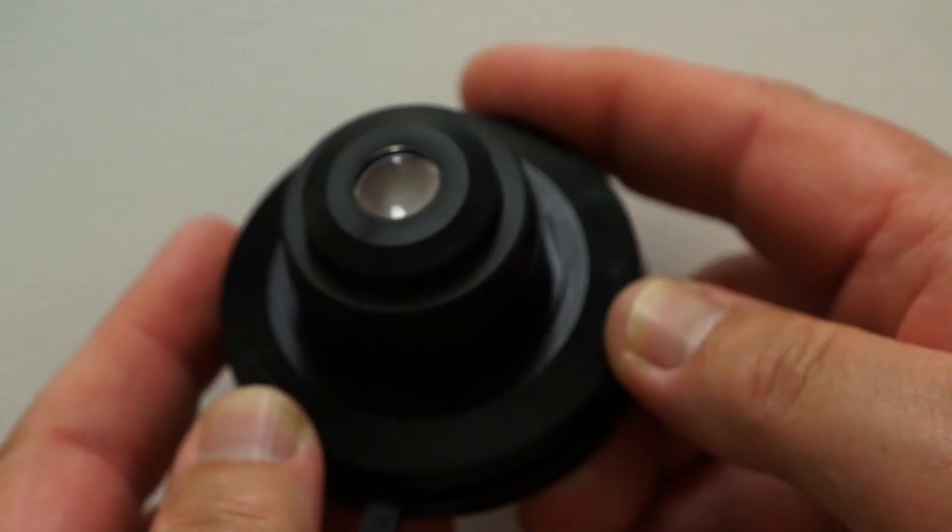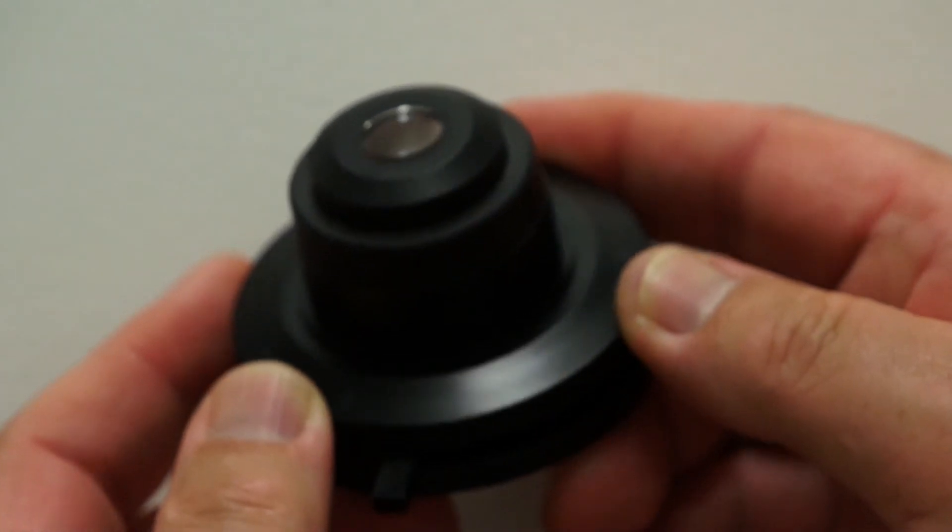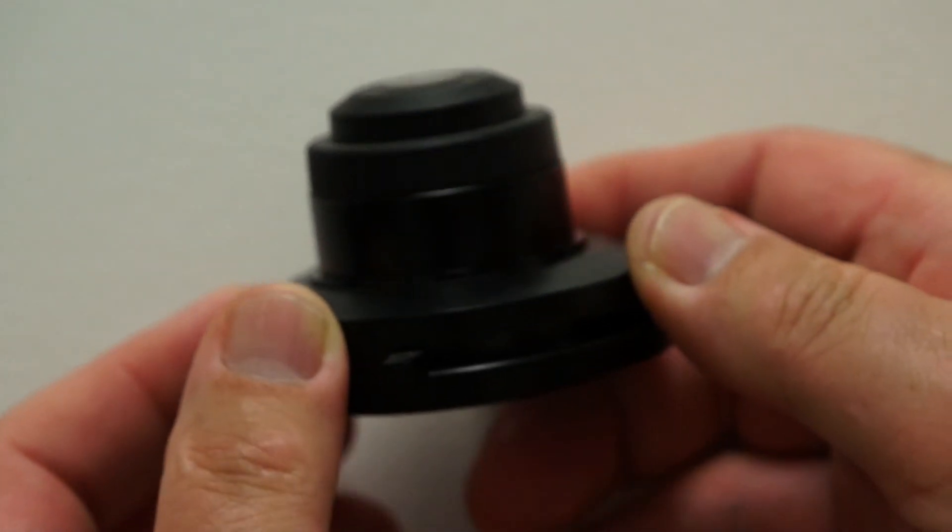Now, remember the important thing about a confocal microscope, and the feature that makes it distinctly different from regular compound microscopes, are the pinholes that are in the microscope. Think of the diaphragm that we use in the condenser to give us contrast and depth of focus on a bright field image.